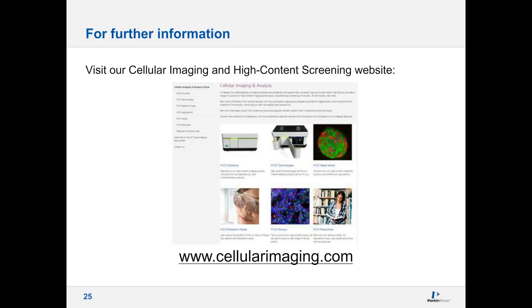Now, as for advice to overcome these, it really comes down to your assay development. So you need to go through the steps of when you develop your assay and validate it to make sure that those are reproducible. And there are some groups that have found that having very large spheroids, in fact, is not a good thing. They prefer to have smaller spheroids for the purpose of light penetration, but also for dye. So getting the dyes and probes into the cells for labeling is very critical, so you can actually detect those in context of the tissue. So I think it really starts, again, with assay design and development and validation of the assay.